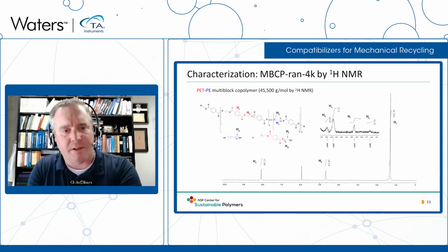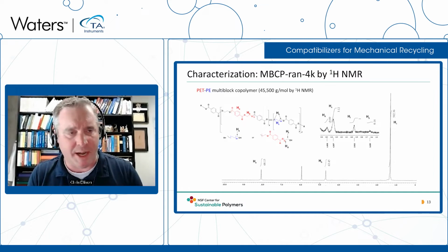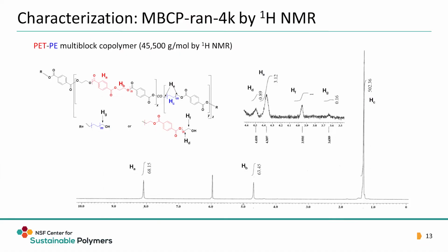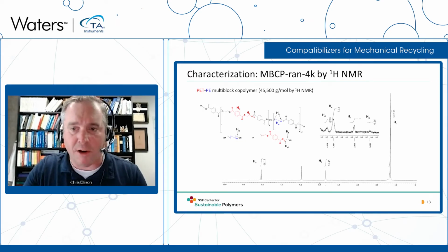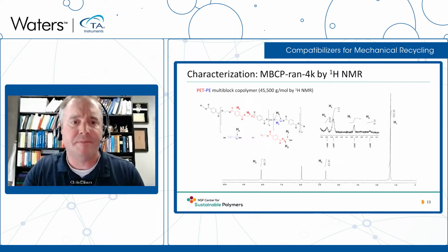The characterization of these materials is a little bit tricky, and I'm not going to spend a lot of time on this, but I'll just point out that due to the way in which these are coupled together with a step growth like chemistry, the number of possible end groups are several. And so NMR analysis looking at end groups has to account for all of the possibilities. This is laid out very nicely in one of our papers. And the NMRs have to be run for fairly long. So some of these NMRs we run for 24 hours to collect enough signal to noise.